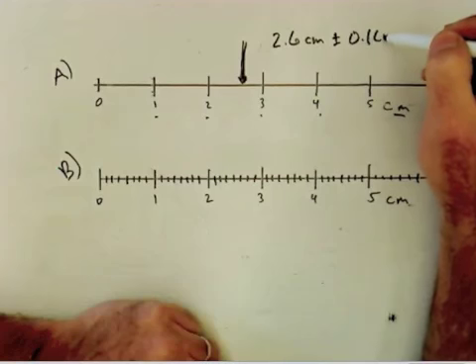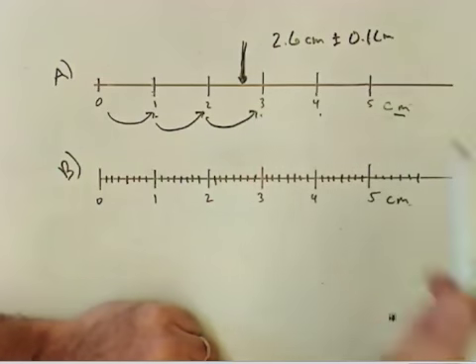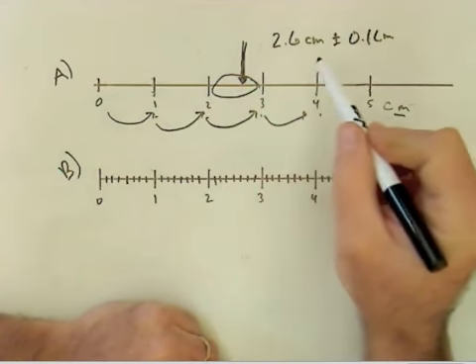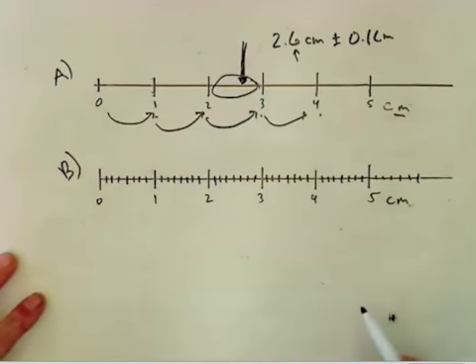These are centimeters. And I'll give myself a little bit of cushion or uncertainty and say it could be off by 0.1 centimeters. Notice the lines were going up by the ones place, which means if you're going up by the ones place and I have 10 imaginary spaces, those imaginary spaces are worth the tenths place, and that's the place we guess.